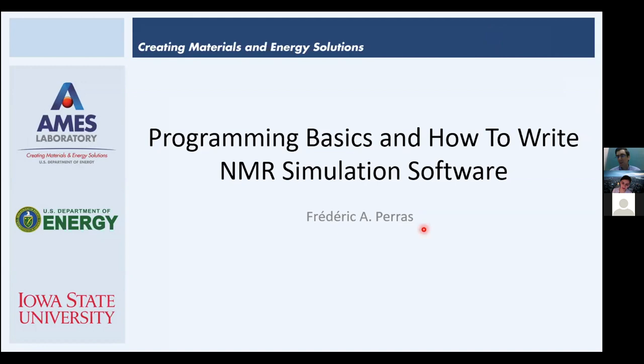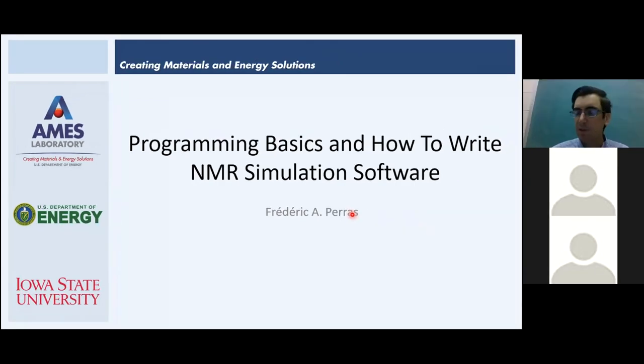This talk is going to be different to some of the other tutorials that were given. The idea that I had for this is essentially to give a very basic programming talk, so that those that have no experience in programming would be able to get up and going and write the NMR simulation software that they would need for their projects.